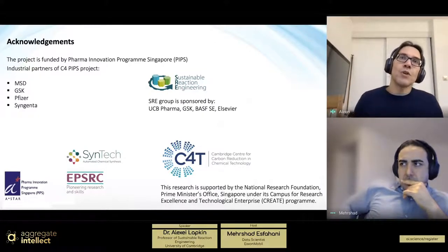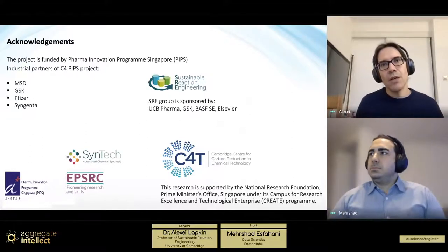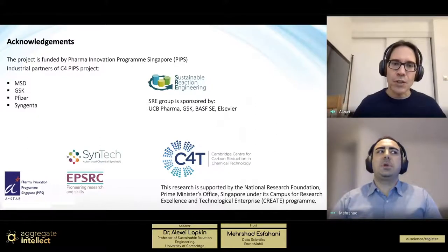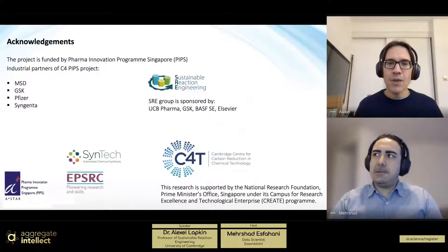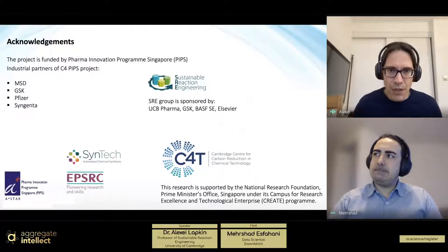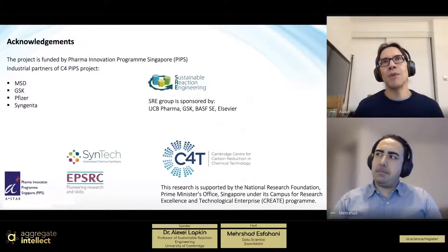But then you also need to make sure that you do not have an excessive sampling so that you don't run too many experiments. So you need to balance looking for an optimum and getting the right statistical function. So exploration versus exploitation. Then you can set up a certain acquisition function. There are a variety of acquisition functions which could be done. We used entropy in the first one, different functions later on. It almost doesn't matter which one. It's basically computational efficiency, which gives you the choice of the acquisition function.